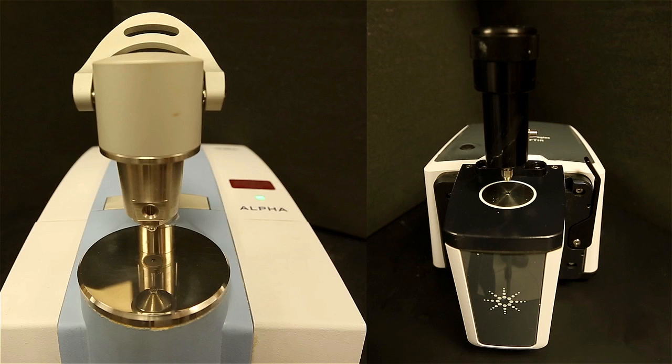IR spectroscopy measures the amount of light, in particular the light from the IR region, that is transmitted through the sample.